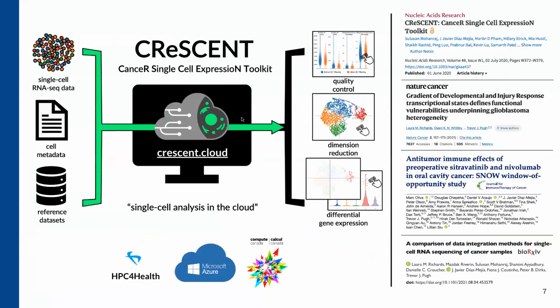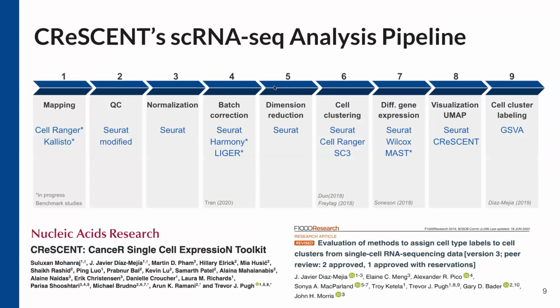And so, talking about how it was done, we need to talk about also what's in these R scripts. So the current single cell RNA-seq analysis pipeline goes through a series of steps, usually about 9 or 10 steps. And it starts at mapping. This is not something that Crescent currently does. Usually what happens is from the lab, you'll get your gene expression data and your single cell data usually mapped straight from the facility. And all you're really giving them is which reference genome or reference transcriptome that you want. So that part is kind of handled for us.